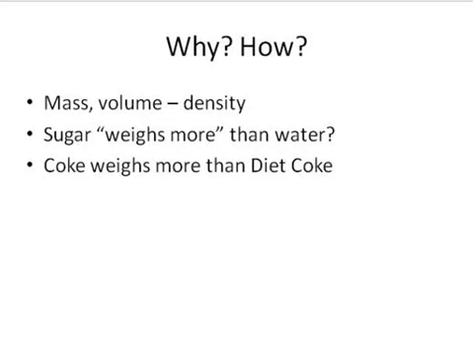The basis of this whole experiment is essentially that sugar weighs more than water. And when we say weighs more, that's a little bit misleading. What we're basically saying is that sugar has a higher density than water. Water has a density of exactly, well, pretty close to 1 gram per milliliter. Sugar has a little bit higher density, and so when you actually mix the sugar in with the water, you will end up with a slightly different result for the density of the solution, which is a combination of the water and the sugar.